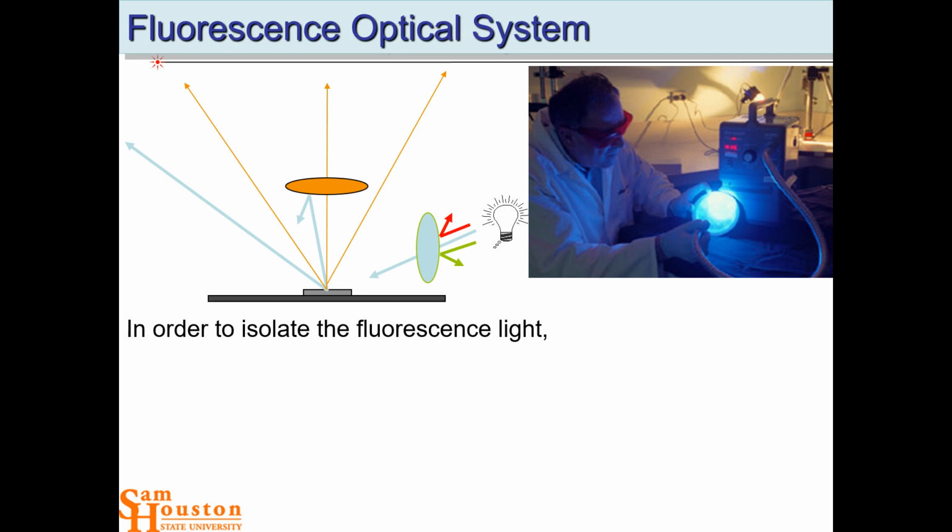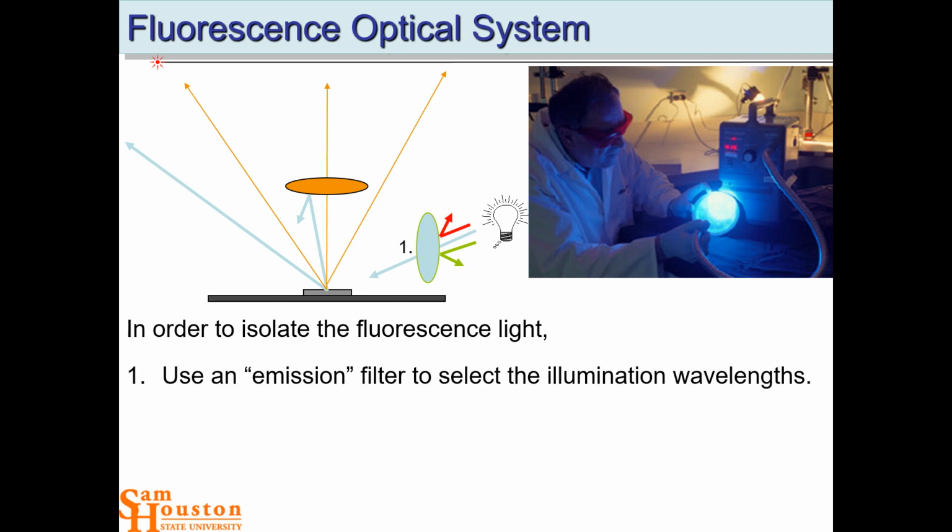Because you can turn the camera sensitivity way up if it's not looking at the source. Okay, if you let the source light through, the camera's going to be blinded. It's going to look into a bright blue spot, and maybe there's some orange photons of light in there. But if you block off the source light, so see here, it's being blocked, then the camera can be set at its most sensitive setting, and it can see the most dim amounts of fluorescence.